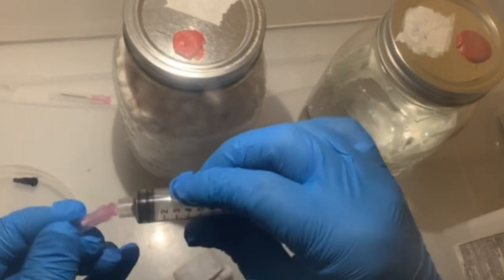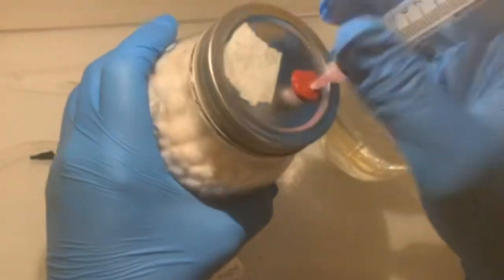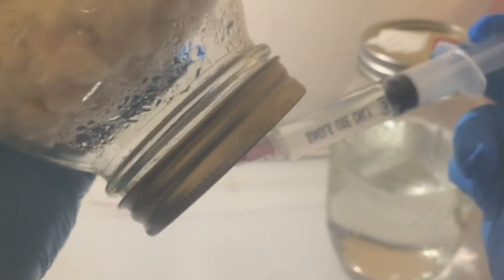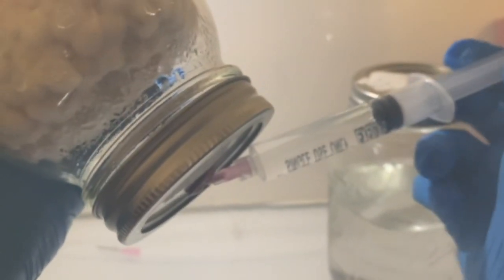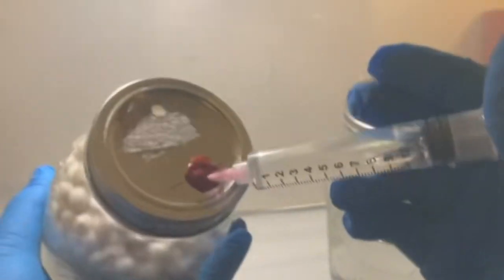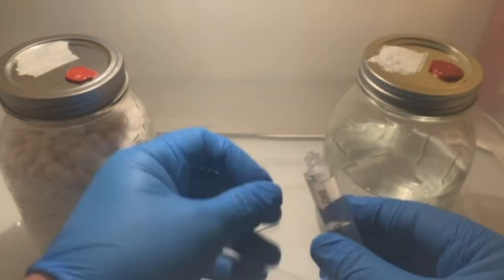Use a new needle to draw it back out into the syringe. And now you have a liquid culture made from a grain jar. This method is really helpful when you're working with a species that doesn't produce spores.